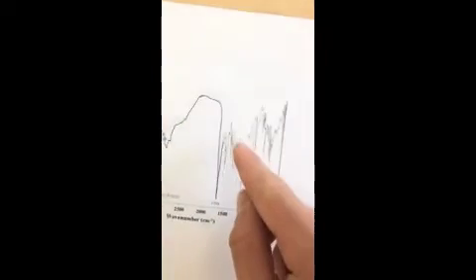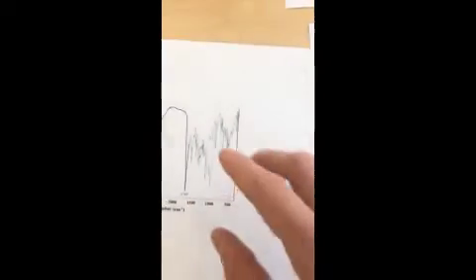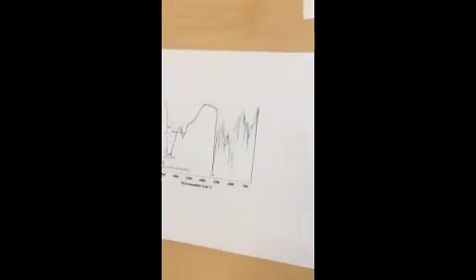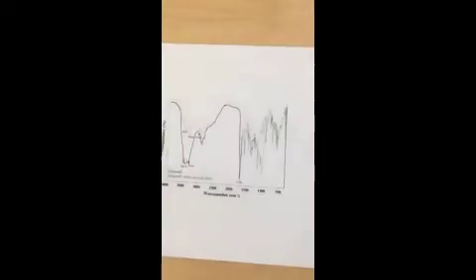And your aromatics also cause a good peak around 1600 to 1585, which would put it around in here somewhere. But again, it was hard to track at that point between the 2 IR spectrum readings that was going on. I just figured I'd point out the main strong ones here.